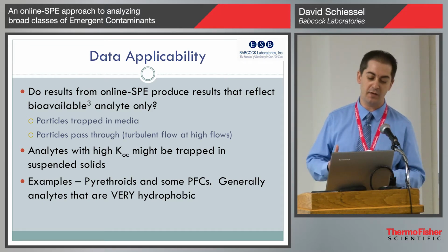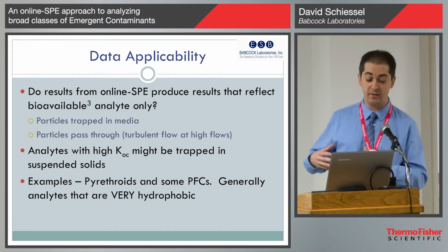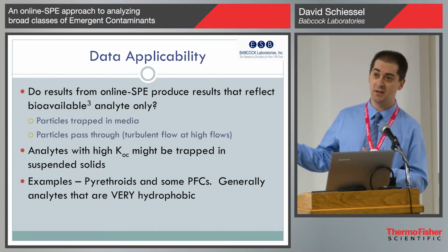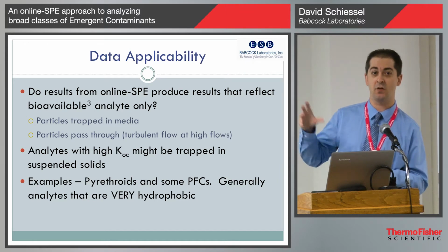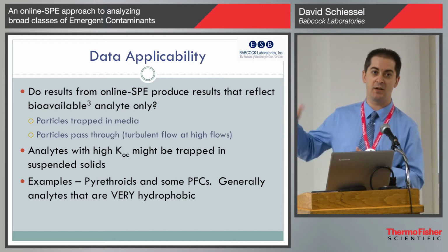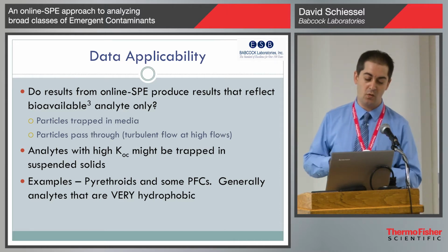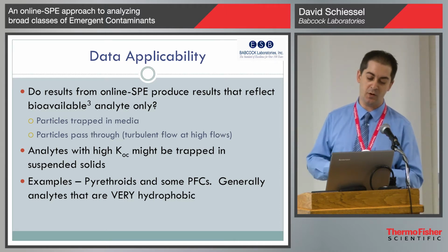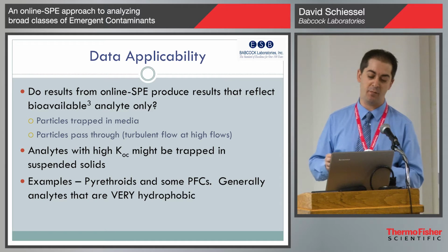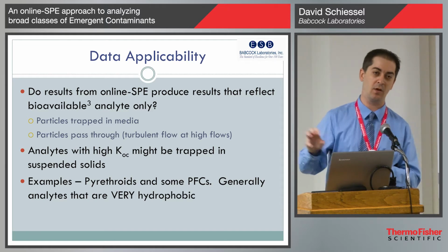But there are two theories. Even if you don't filter the sample, particles could be trapped in the media, and in that case the particles would be solvent rinsed during elution with the mobile phase, which includes a high gradient of methanol. Or at turbulent flow or high flows when you're loading the sample, those particles could actually pass through if they're small enough, and at that point your analytes would go along with the particles.